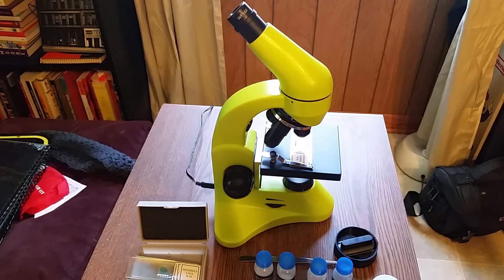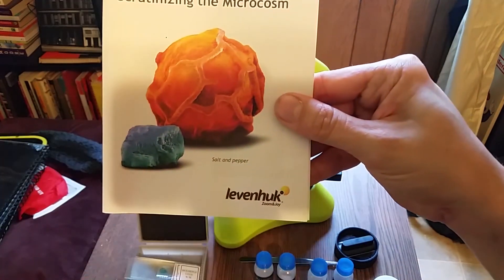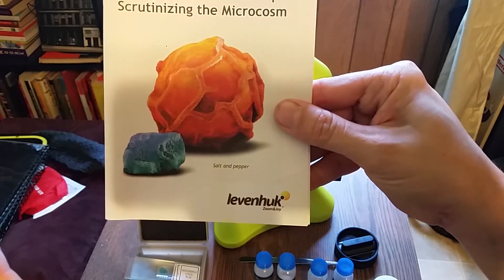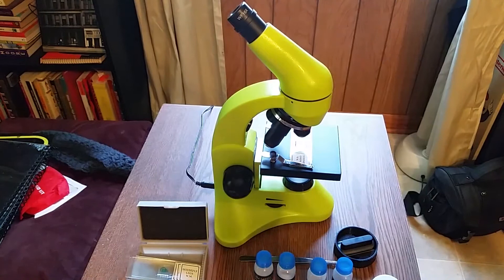Hey there. Today I want to briefly consider this 50L Plus Rainbow Series Microscope from the brand Levenhuk. You'll have to forgive me for not trying to enunciate that, but I butcher pronunciations sometimes, so I thought I would just leave you with the word.